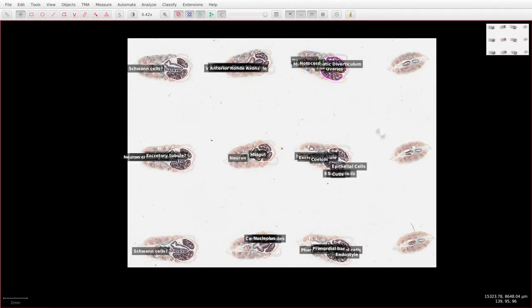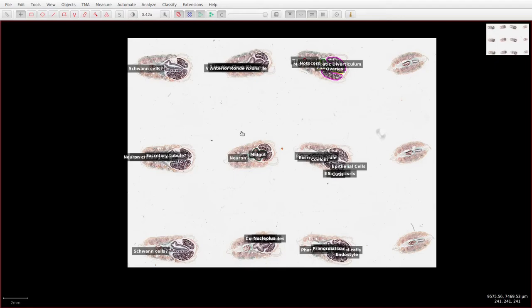Hello and welcome to Down the Scope. In this video we're going to be going through the nervous system, reproductive system, and notochord of the amphioxus.